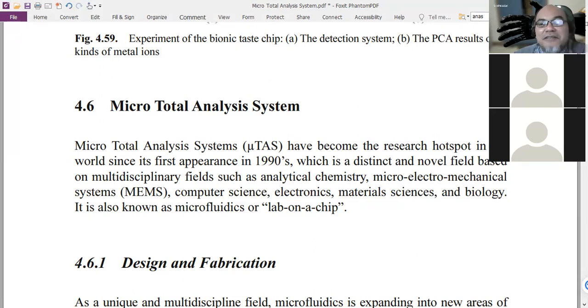And it's not economical. We have the technology ourselves from batik technology, built by our ancestors. You can use that technology. You don't need to make a digital wax printer. Alternatively, that method using paper is one way.